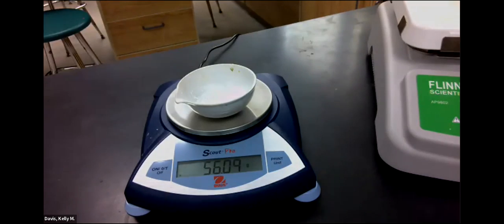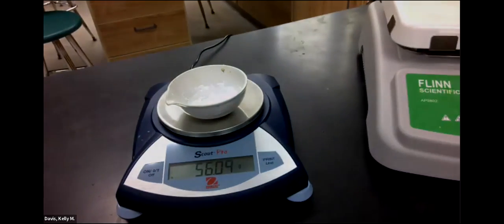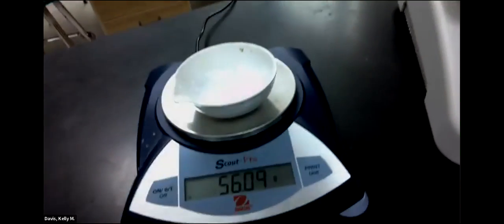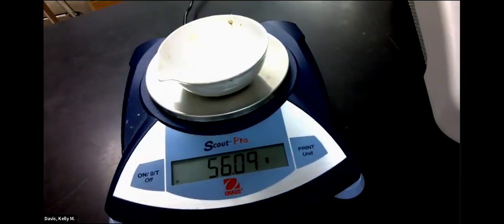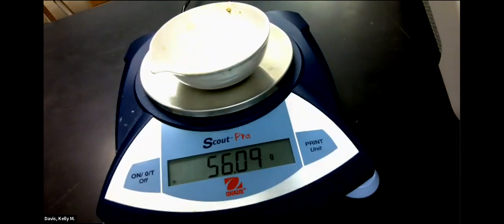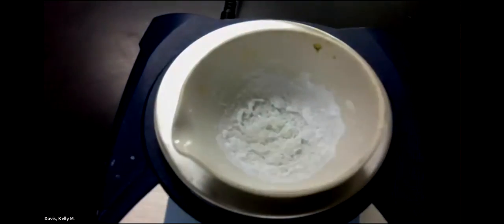Okay, so I took it off the heat a second time. I'm going to shut that heat off now. And the mass now is 56.09. Let's show that, 56.09. And that is after the second heating. Because the mass didn't drop very much, I'm not going to heat it a third time. You can sort of see what it looks like in there. It's pretty dried out.